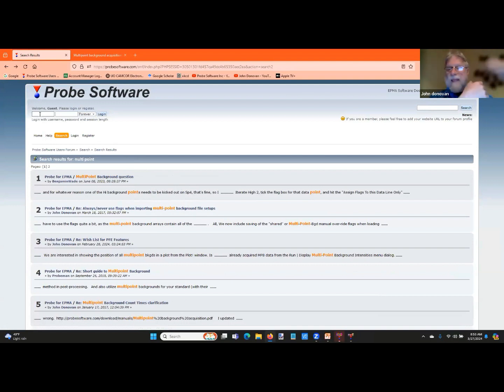But if you have standards in ProbePMA, which you're going to do anyway, right? Now you can quantify any maps you acquire. It doesn't take any more work. It doesn't take any more acquisition time to acquire standards if you're going to do quant analysis for points. You use the same standardization you use for your unknown points as you do for your unknown maps. It's exactly the same process. We treat every pixel just like a point analysis. All right.